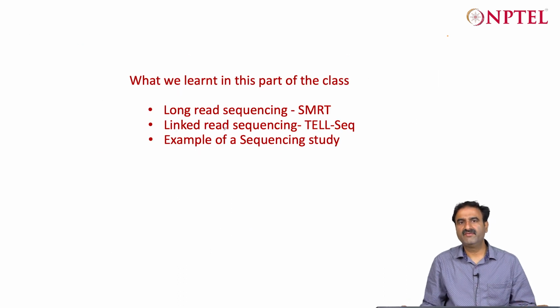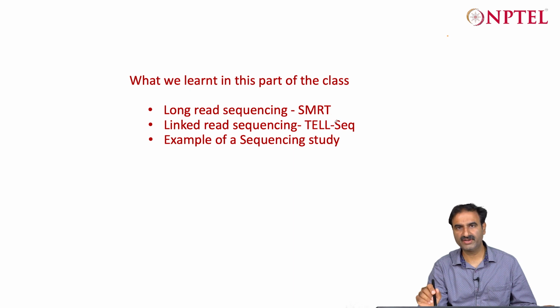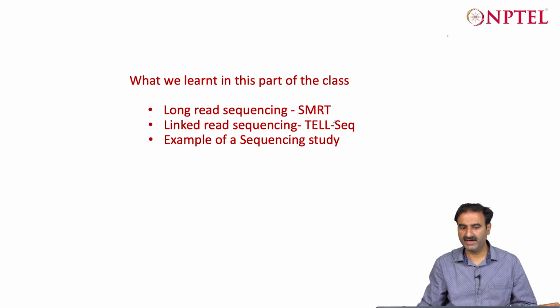So we will be covering the sequencing application aspects, how to approach genome sequencing and assembly, and how to design a genomic sequencing project in the later part of our talks. For this class we covered one more method of long-read sequencing, that is SMRT or PacBio sequencing, another linked-read sequencing technology called TELL-Seq, offered by Illumina, and an example of a metagenomic study where we generate sequence data from the sample that we have collected for a project.